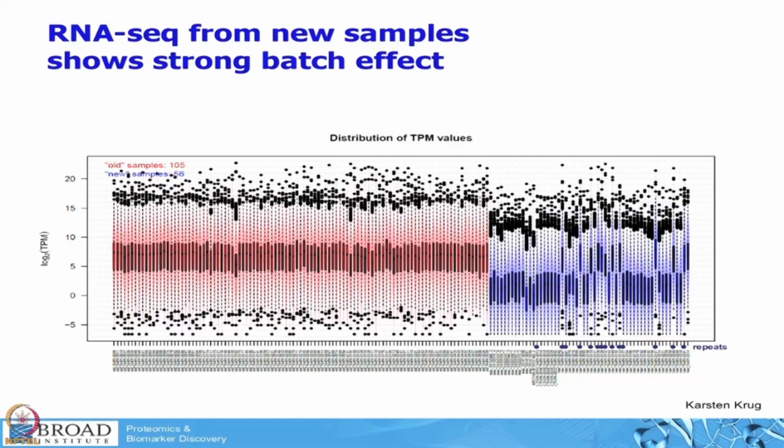If you look at the second batch, this one was a new set of samples, but it also had replicates from this set. So things marked with a star underneath are replicates from this batch. You take the same sample from this batch and you run it like a year later. You can see how different they are. And so the question is, now I want to put these two together and do an analysis, because I got more samples. When you have more samples, you get more statistical power.